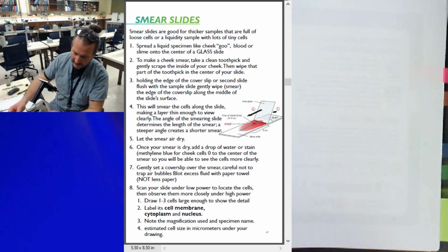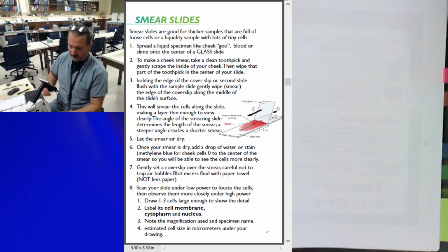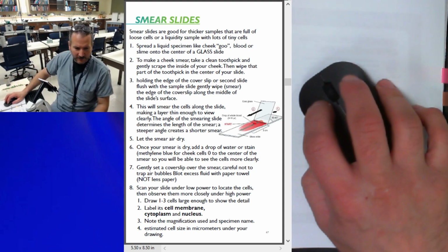And then we're going to take it, slide it underneath. Just get that out of the way. Thumbs bring up the spring clips, sliding it back, turning on my underlight coming up, and let's see what we have here.